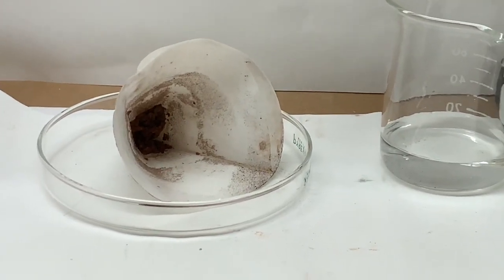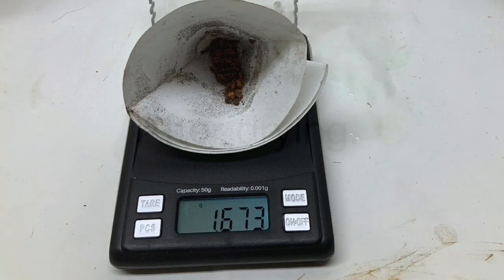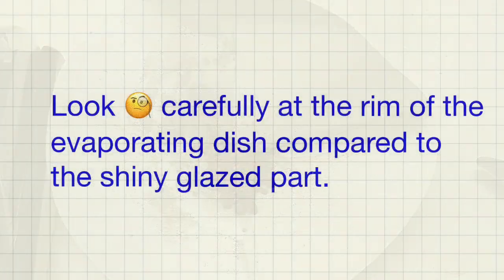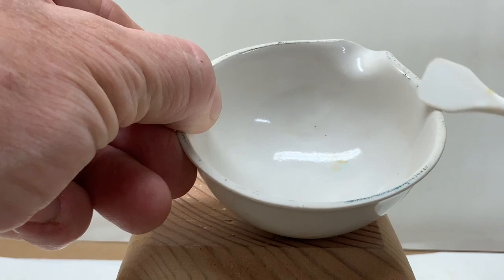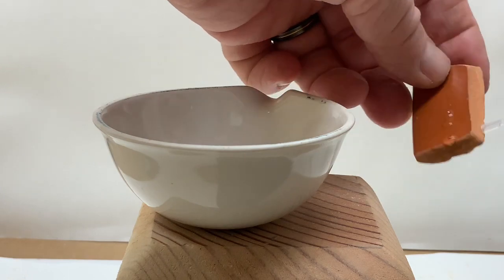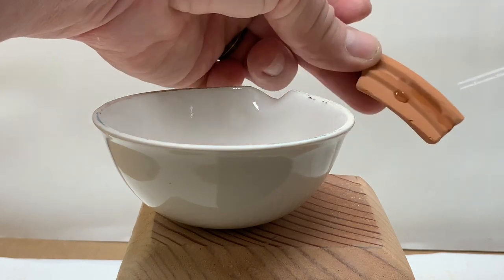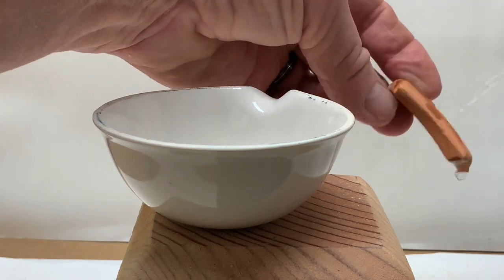One more measurement to make, and then a quick look at the rim of the evaporating dish, and then you'll be all set to process this lab data. Hopefully you can look carefully and see that the edge of the evaporating dish is not shiny the way the rest of the dish is. Just like a plant pot, notice how water behaves on the shiny side as opposed to the unglazed portion. There is a post-lab question that will refer to this particular attribute.